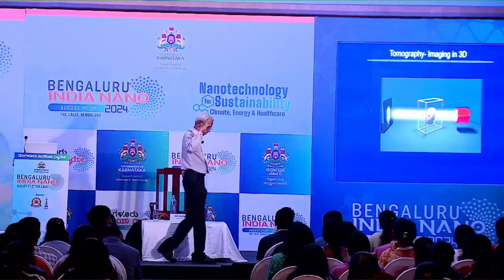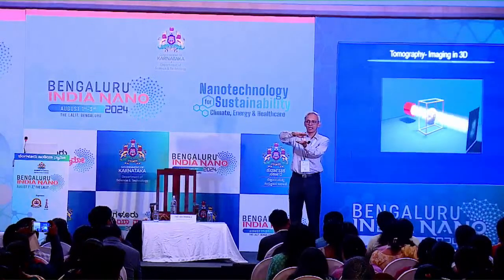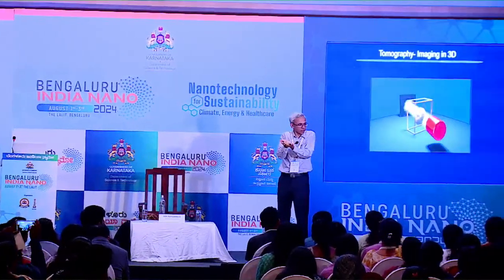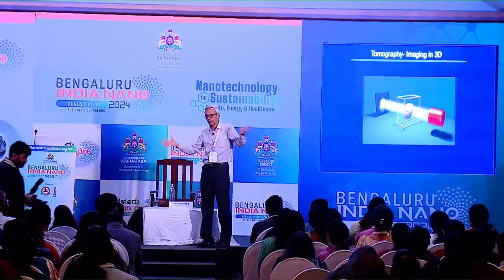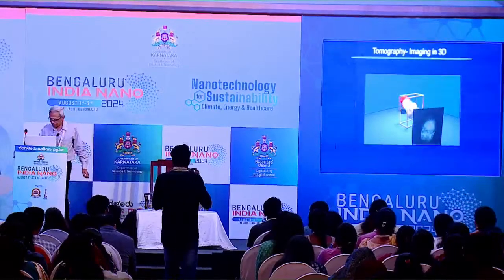The last 2 examples that I will give you have to do with actual tomography. Instead of doing it from a single image, if you have a multi-component system, we can tilt and get a tilt series and then reconstruct, just like you do in tomography, right? CAT scan or whatever it may be. You can tilt the sample at different angles and put all this information together to completely get 3-dimensional information. So that can also be done.